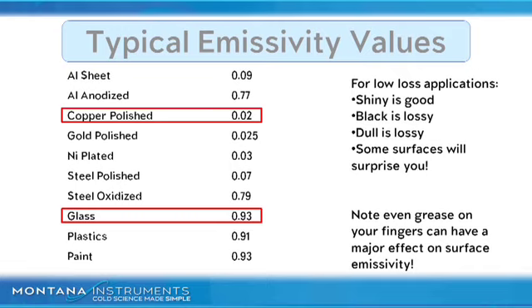This is not the case if the surface is oxidized or has oil, for example vacuum grease or finger oil on it. You can easily raise the emissivity of a part if you are handling it without gloves. You will leave a buildup of oil on all those parts and the emissivity goes up as well as the heat load in the cryo. And to make matters worse, finger oils will fly away when you pull a vacuum and you'll end up with these depositing on some cold surface. It is very important to maintain cleanliness inside the cryo environment.